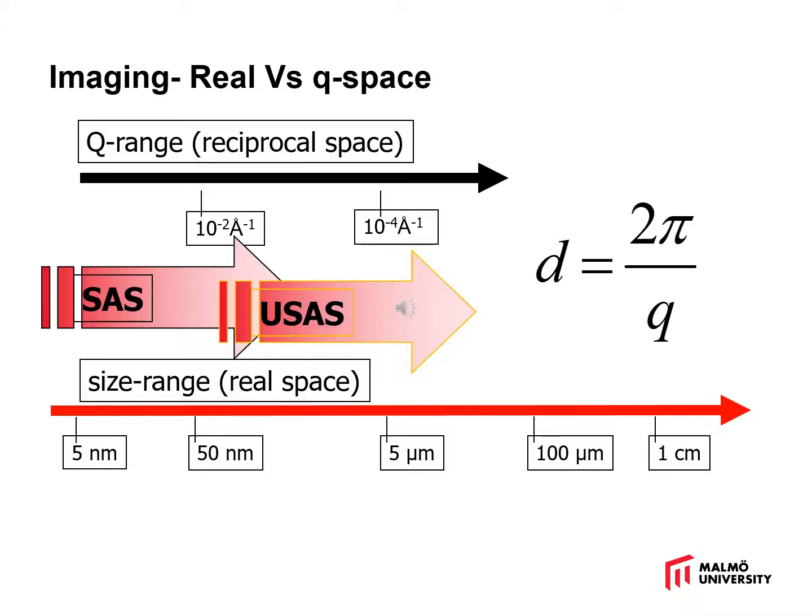One is always restricted to the number of things you can see, and there may be some special preparation, particularly in the case of electron microscopy, to access such small ranges. Small angle scattering, by contrast, is measured over a sample volume in something that's really quite like the natural environment of what you're measuring. For example, in biomembranes, it can be in a solution or sometimes even in cells.